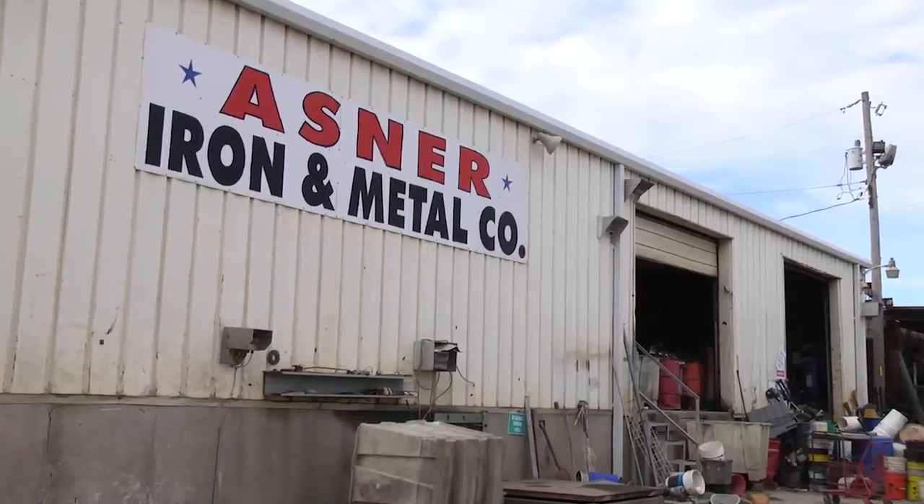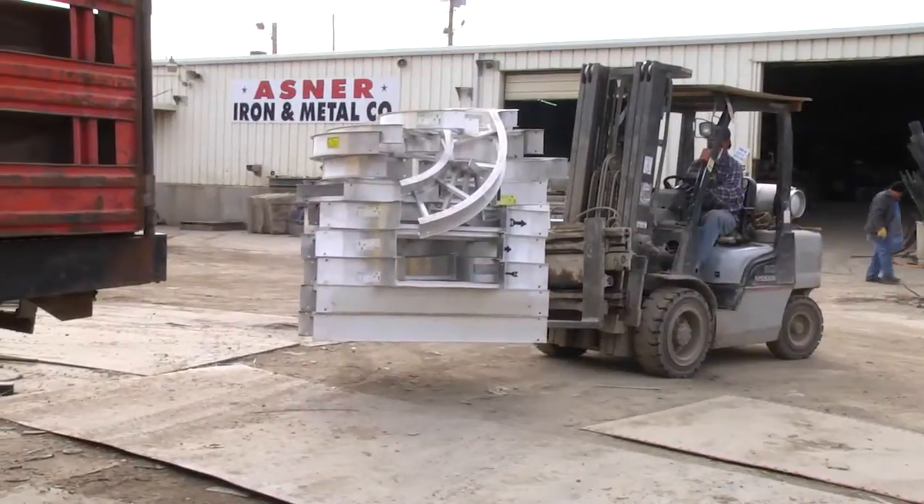My name is Lenny Basson. I'm the operations manager for Asner Iron and Metal Company in the Greater Kansas City, Kansas area. This is a scrapyard that's been here for in excess of a hundred and ten years.